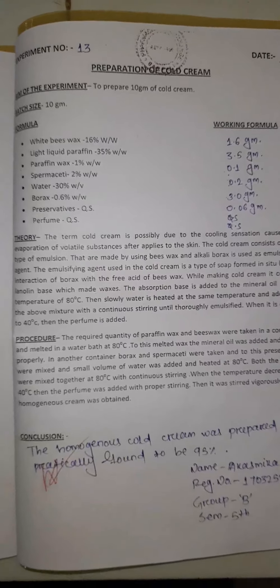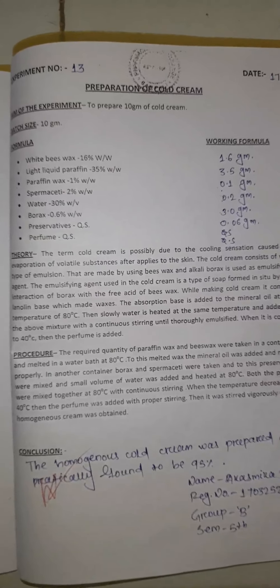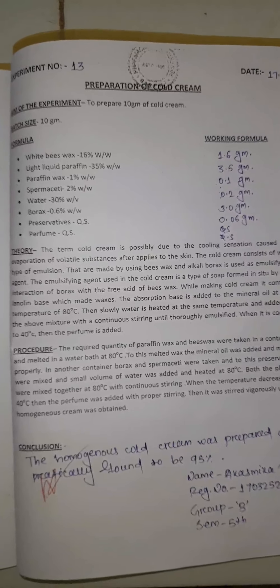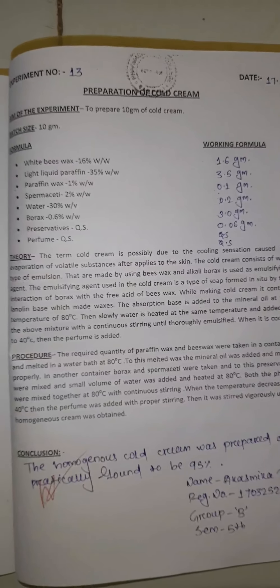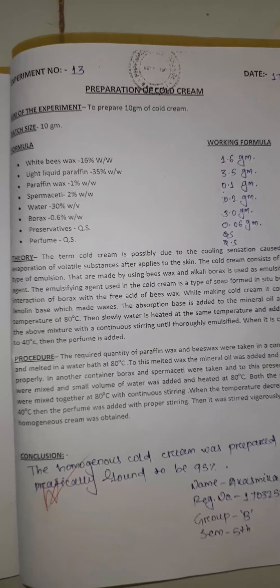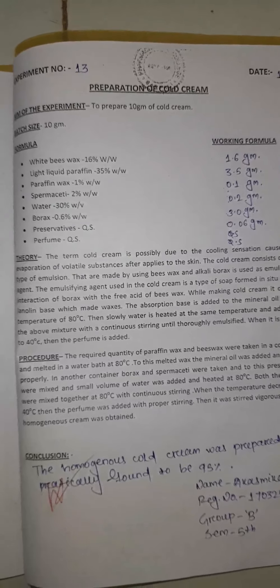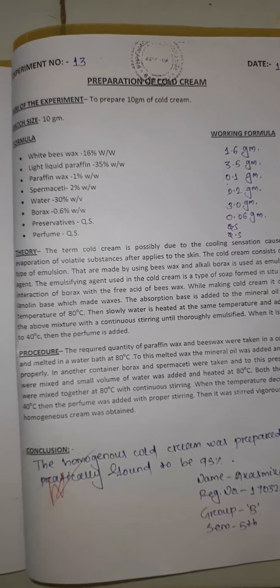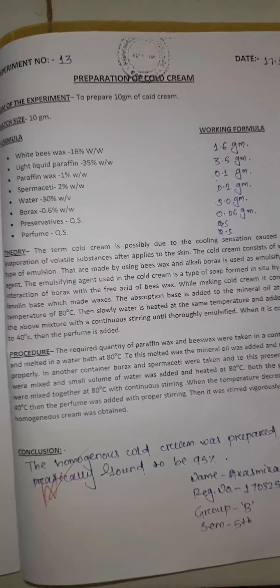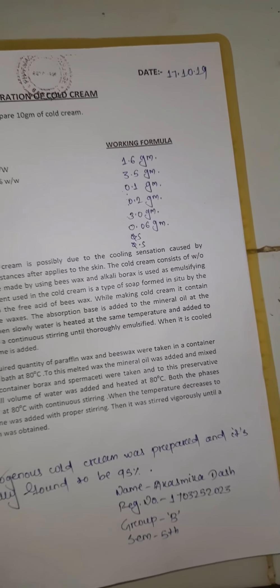The formula ingredients are: white beeswax 16%, light liquid paraffin 35%, paraffin wax 1%, spermaceti 2%, water 30%, borax 0.6%, and preservative and perfume quantity sufficient. The working formula will be determined from the main formula.